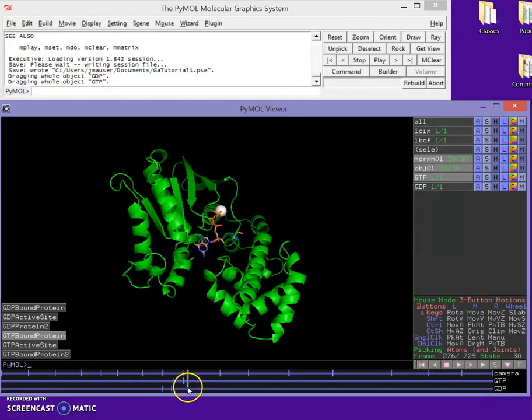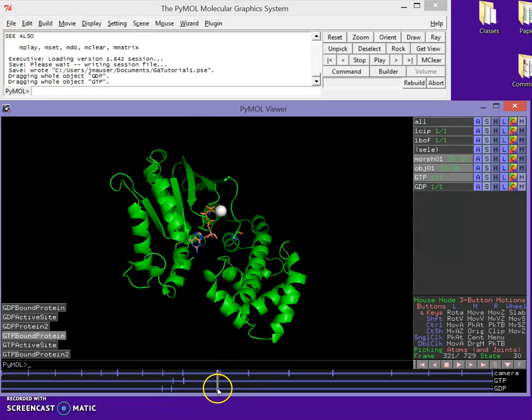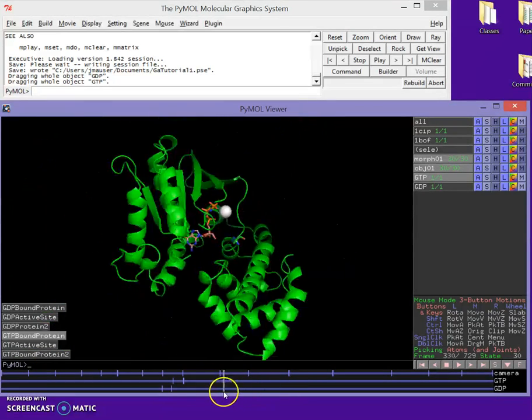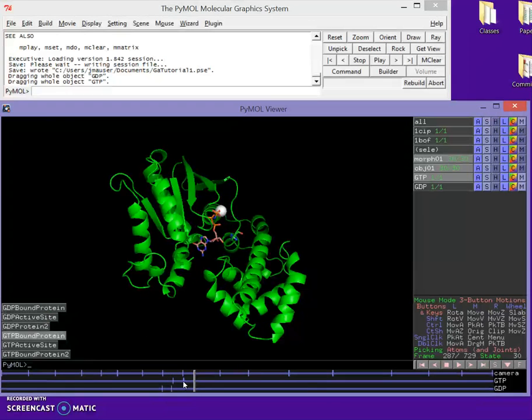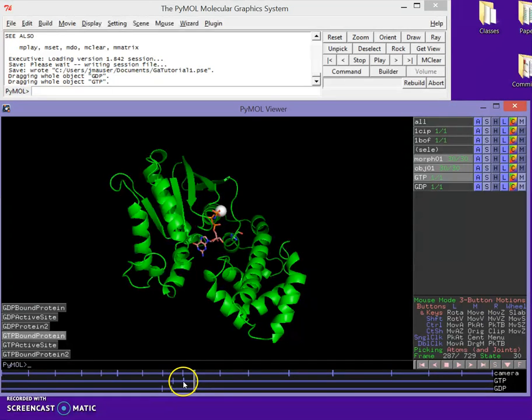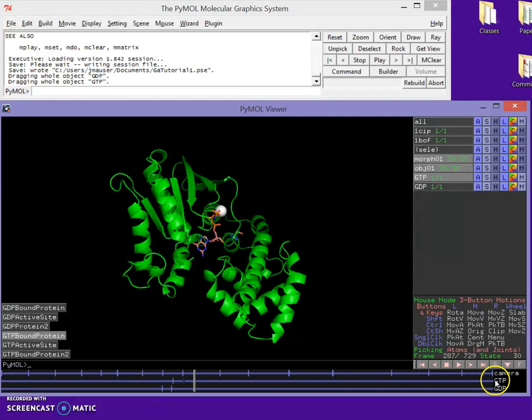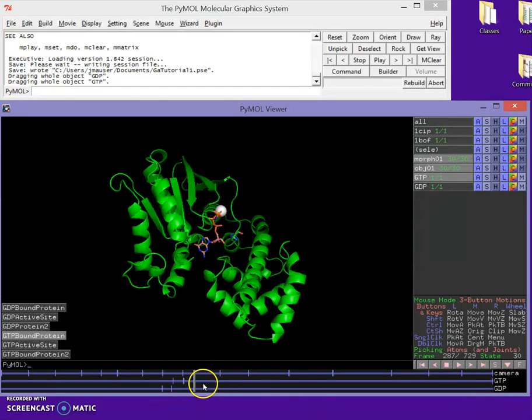Now, if you notice, there's some wiggling in here. It's not what it should be doing, but it's gradually flying out to try to loop. So we need to copy those frames from the beginning and the end. So I'm going to Shift right-click on my GTP to the end. So it's the nose to hold that GTP there. Shift, right-click, and drag. Shift, right-click, and drag. There we go.